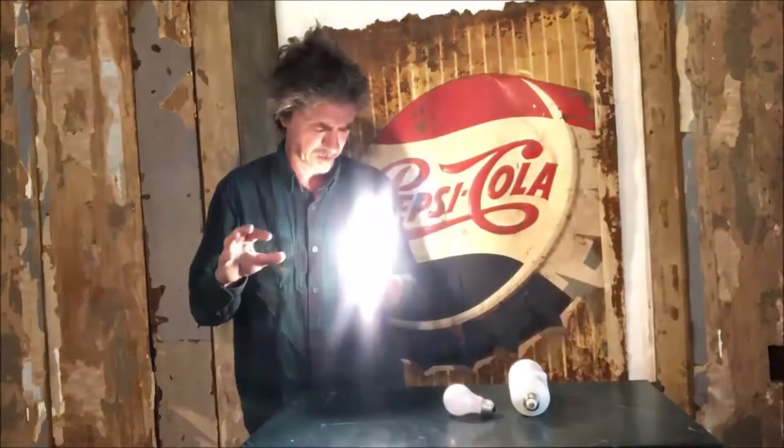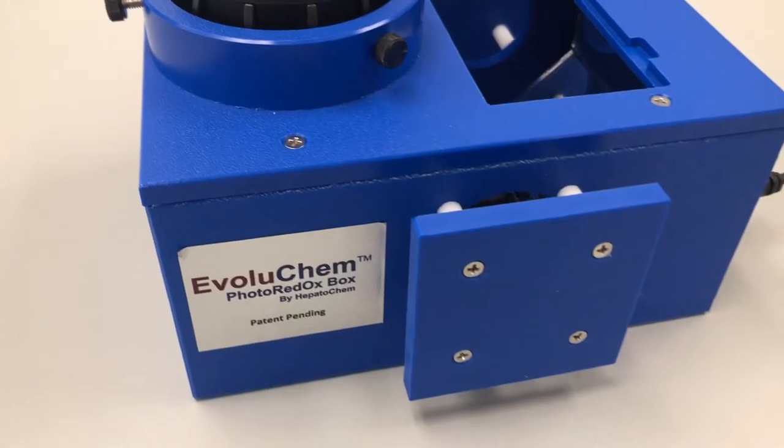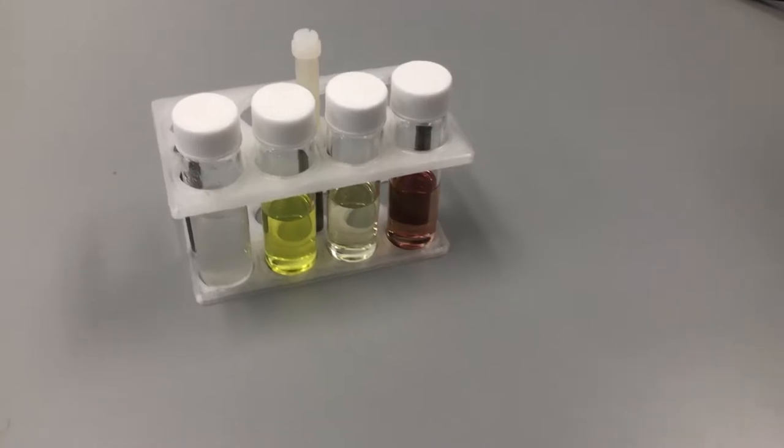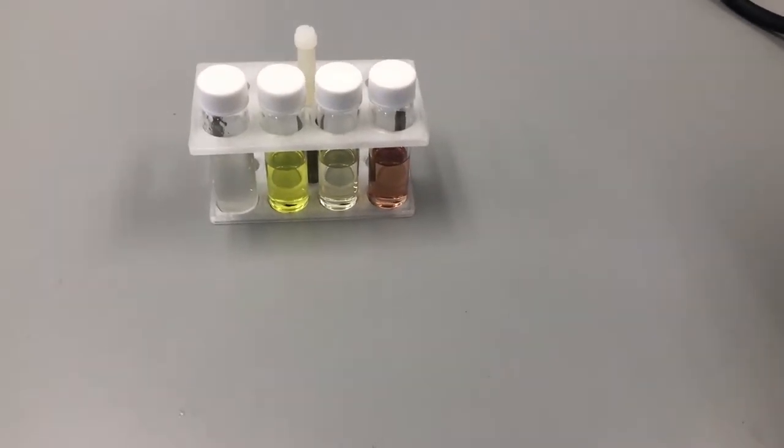But then we got an idea. We have a photoreactor, specifically our very own photoredox box, and we have some basic catalysts that will fluoresce the three primary colors of your standard traffic light.